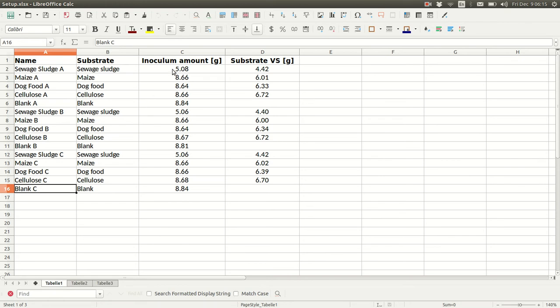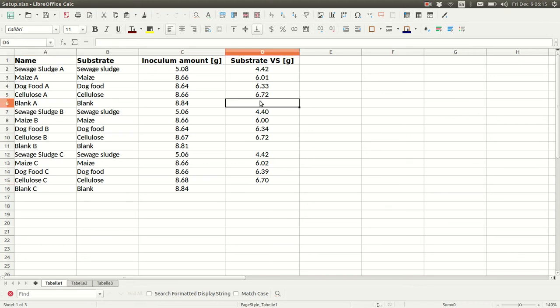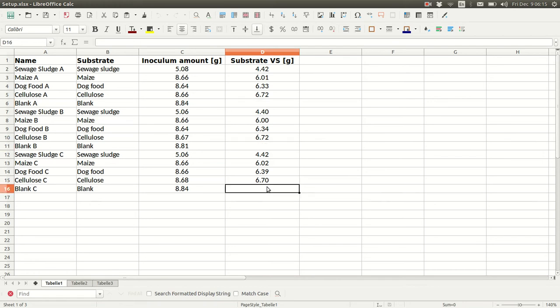Then we need to know how much inoculum went into each bottle. And lastly, the amount of substrate. Typically that'll be grams of VS if you want to calculate BMP normalized to VS mass. And we can see there's no substrate in the blanks, the inoculum-only bottles.